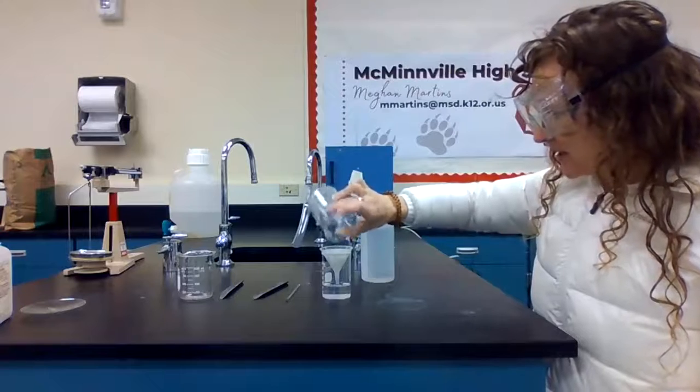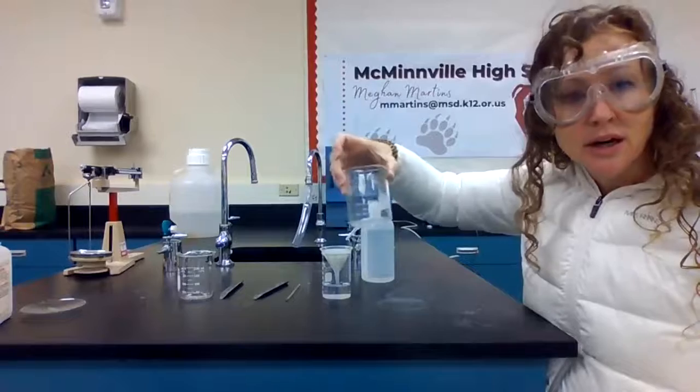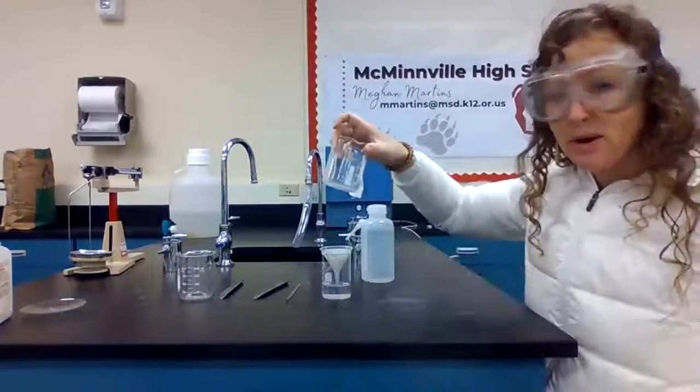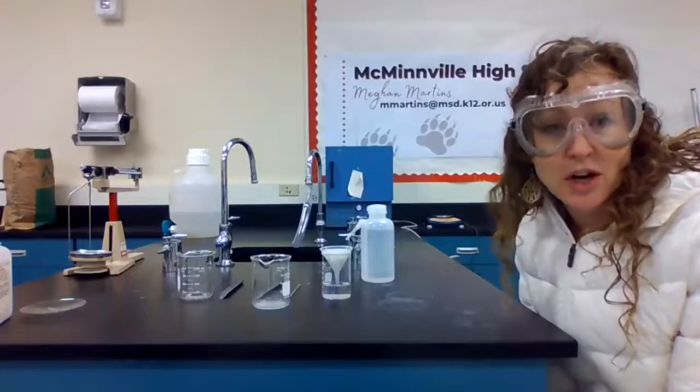What you really want is to collect all of that solid out of your beaker and get that into your filter paper. So we're going to let this finish draining, and then we're going to talk about the drying process.